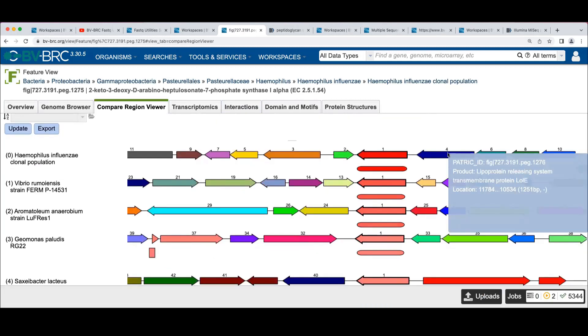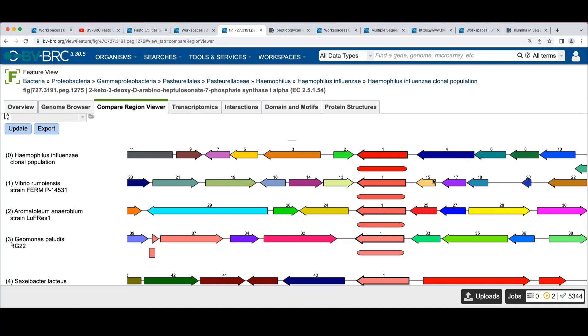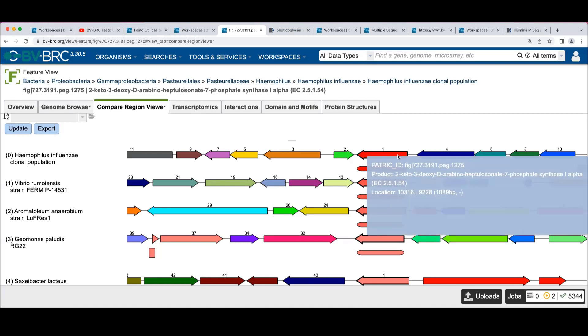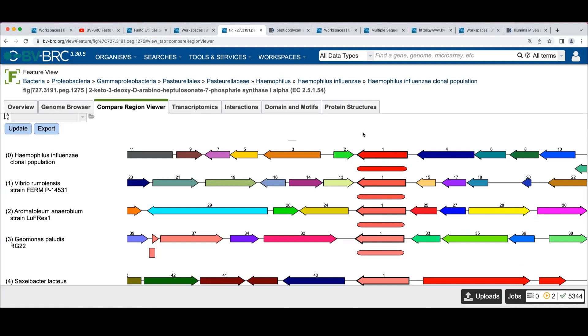Hopping back a couple of things. Remember, I had double-clicked on this protein of interest that was broken in three pieces on one of the contigs. So here I'm looking at the one copy that wasn't broken, and this is Haemophilus influenzae clonal population.